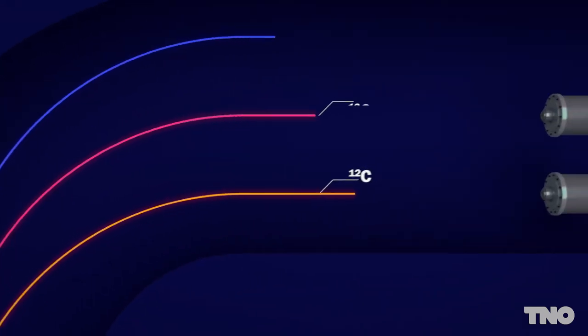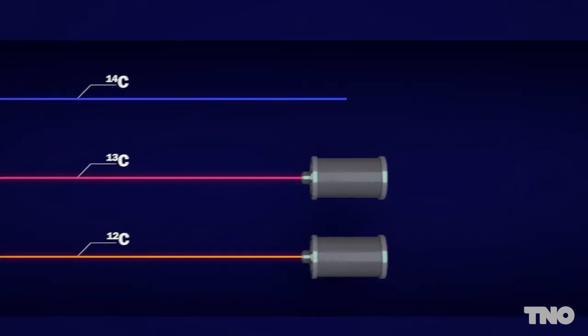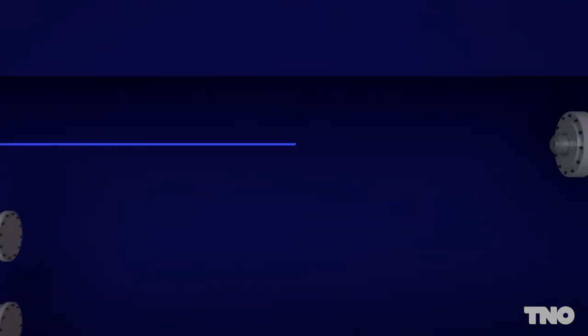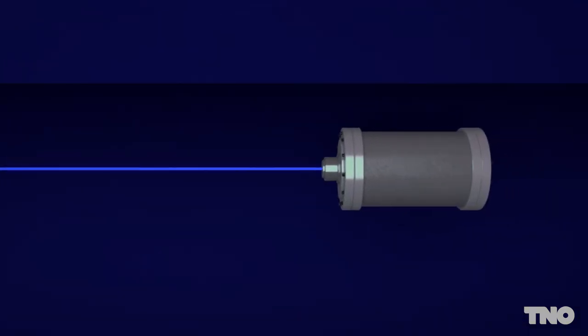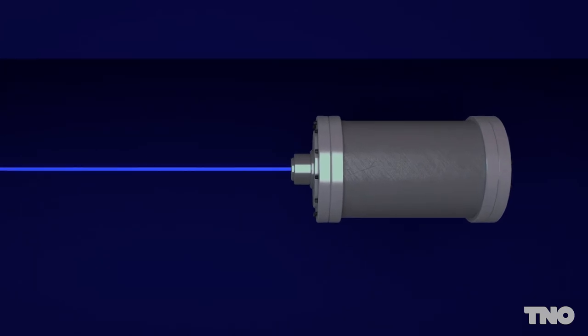The C12 and C13 ions are directed into two separate Faraday cups to be measured, while the heaviest C14 ions are forced into the widest path to a gas-containing barrel. The C14 ions collide with the gas, causing charge releases.